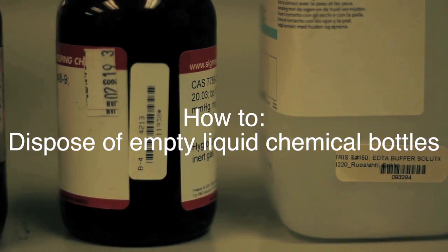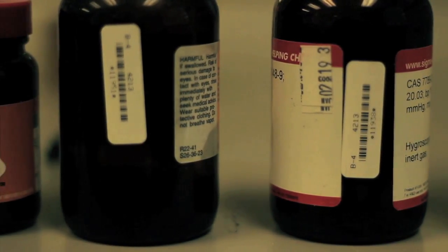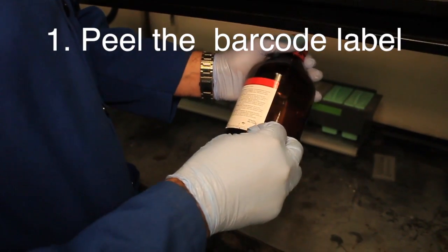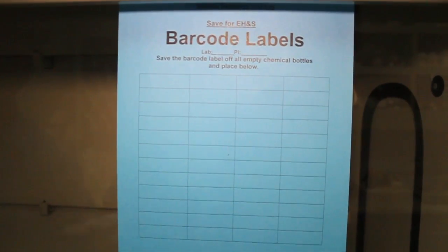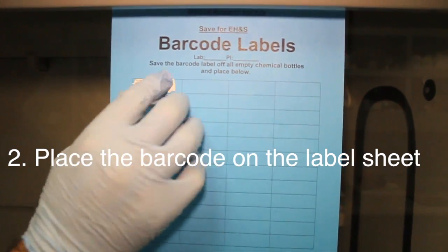How to dispose of empty liquid chemical containers. First, make sure to peel off the barcode label and place the barcode label on the blue label sheet provided.